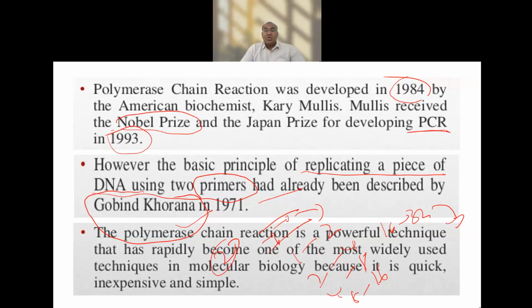So we brought that genetic test, molecular basis test, to the lower level, so that a person without money also can afford to go for the diagnostics to identify the different types of diseases. This is why we are using this PCR. We call it a polymerase chain reaction.